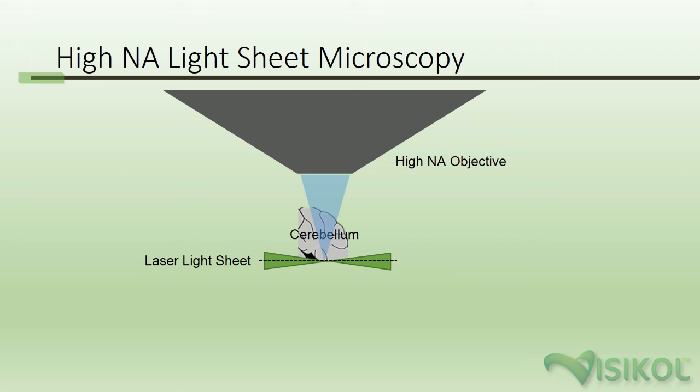This process can be clearly seen here, where a whole mount spinal cord cleared via iDISCO is imaged for autofluorescence using an Ultra Microscope from LaVision. The streaking in the tissue is caused by refractive index mismatches in the mounting solution that cause optical aberrations.